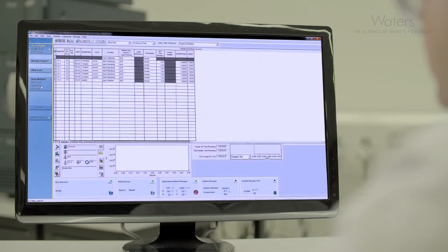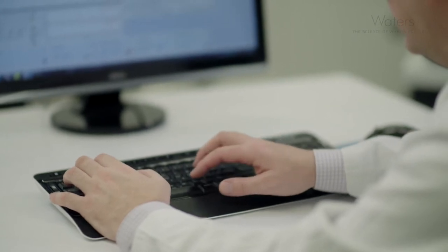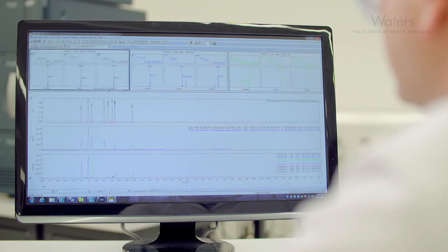Today, we're going to use the latest version of Empower, and this includes additional features that have been specifically designed to enhance the peak tracking capability of the Acuity QDA.